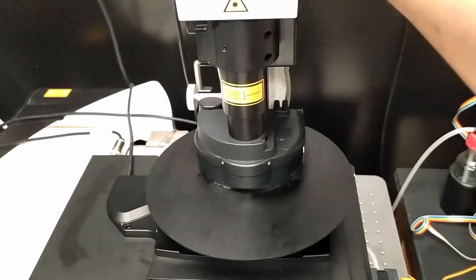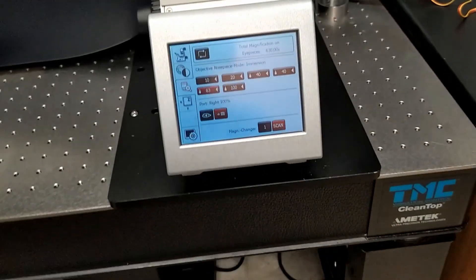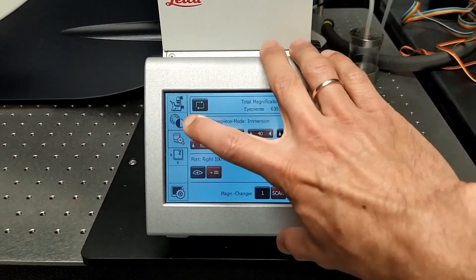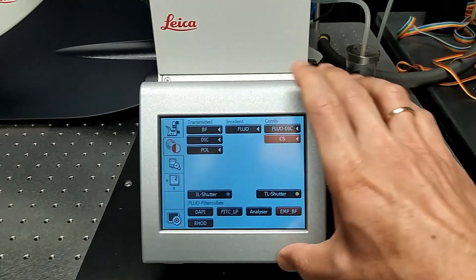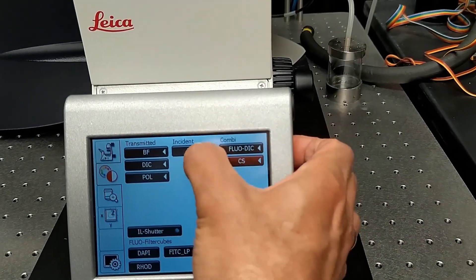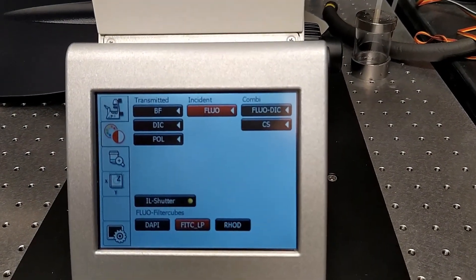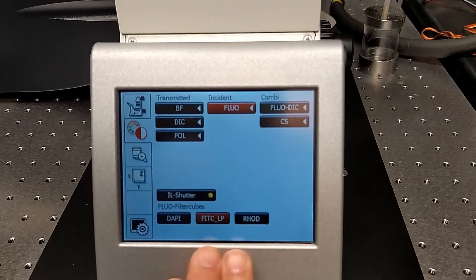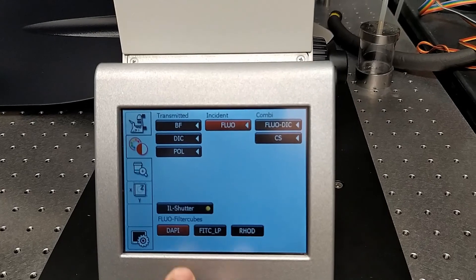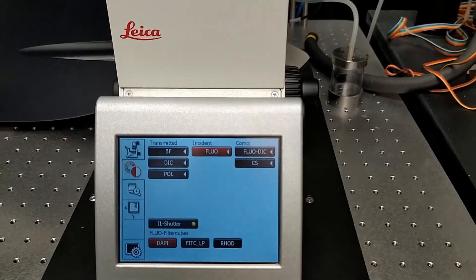Then lower the condenser arm. On the touch panel, switch to the fluorescent controls tab. There are three fluorescence cubes: DAPI, green, and red. Using either of those, you're going to have to look through the eyepiece.